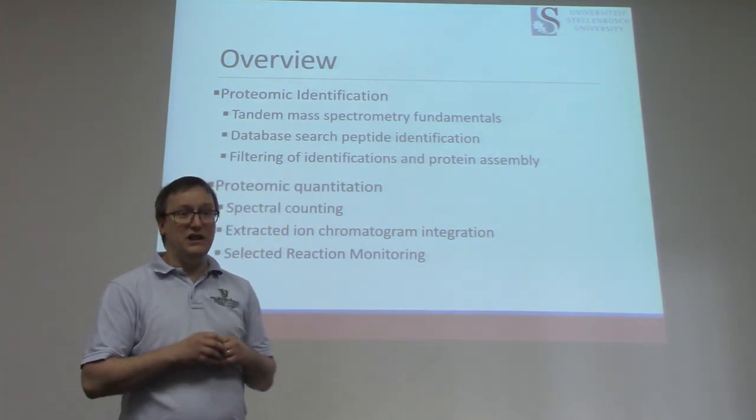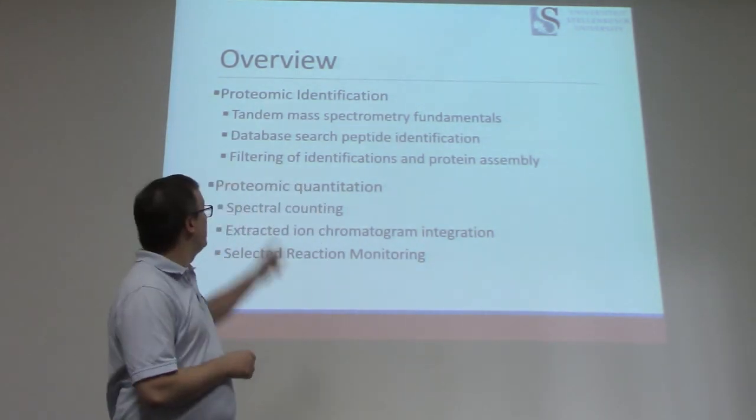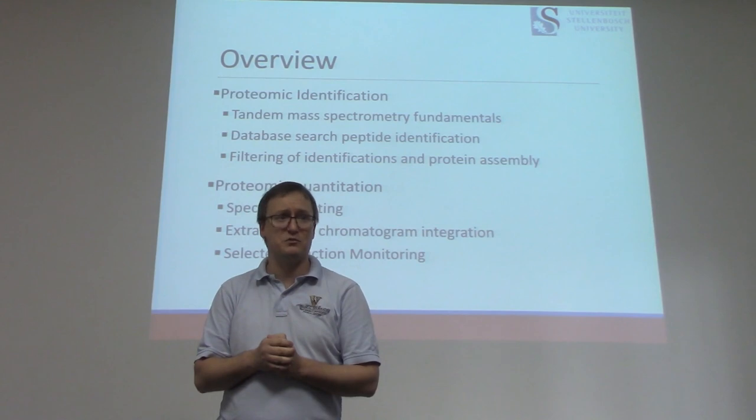We're going to talk about the key algorithm, the greatest hit of proteome informatics, which is the database search algorithm. And then we will move on to talk about how we figure out what we actually trust from these algorithms and infer proteins from those results.